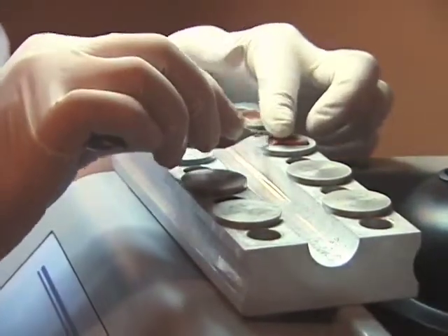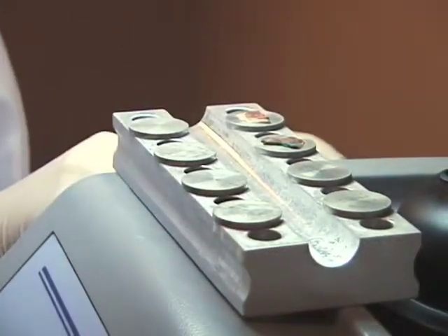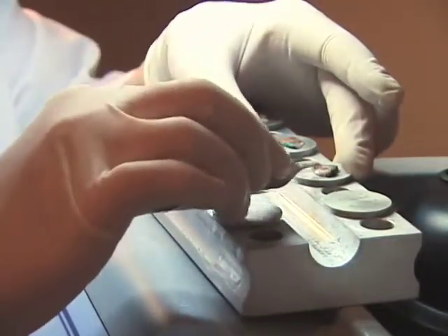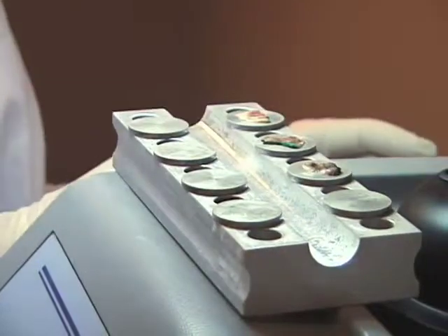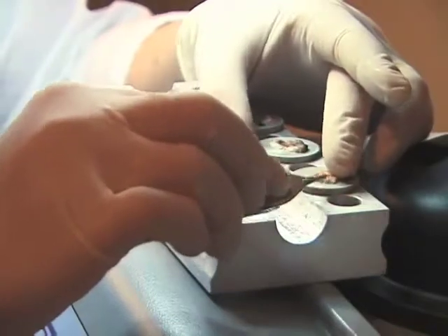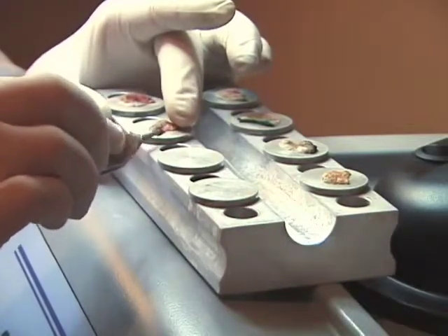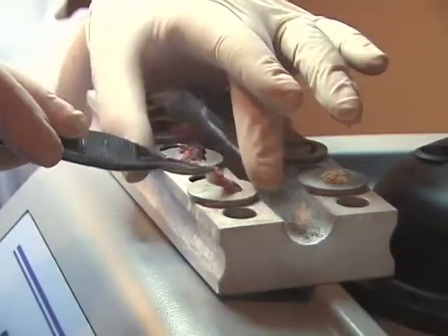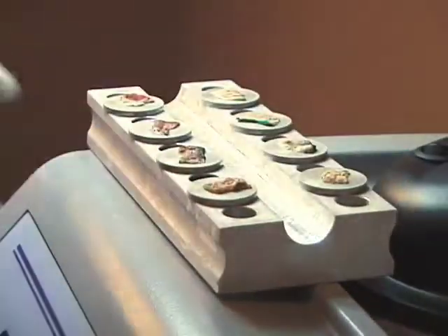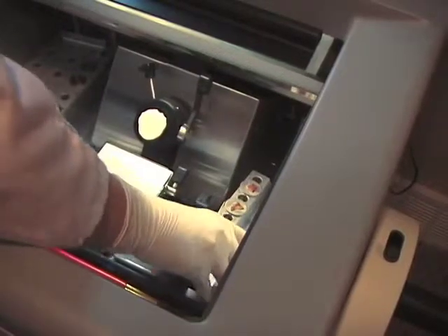All eight of these pieces can be viewed at eye level and easily turned to see all sides. Even when demonstrated slowly for teaching purposes, all eight pieces are oriented and frozen in just over one minute. It will take another two minutes to assembly-line embed them.